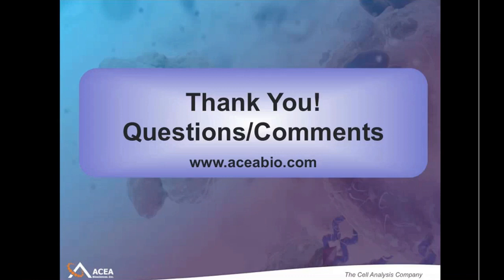And higher degrees of data spreading are certainly associated with higher compensation values, and it is an important consideration. However, I would argue that the objective of running flow cytometry analysis is not necessarily to draw perfect pictures, even though that's fun. I would say that the objective is to generate high quality data that can confidently answer your specific scientific questions. So I would say that concerns about data spreading should be application and panel dependent.